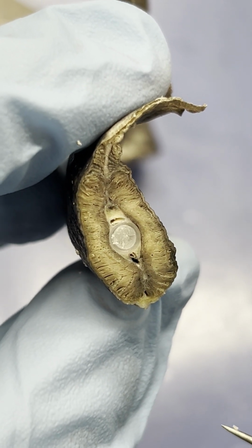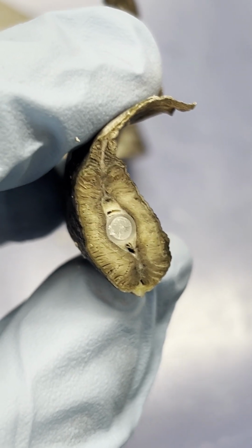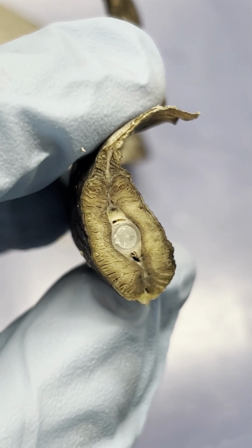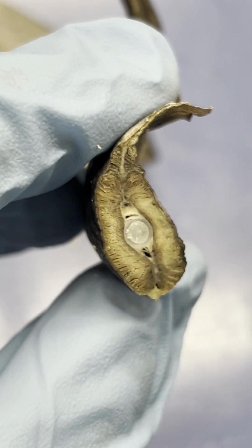Keep in mind that veins in general carry deoxygenated blood going back to the heart, and arteries generally carry oxygenated blood. We'll go over that more when we go over the circulatory system in depth. So again, this is the tail cross-section, 3.6D. Now let's go to the other cross-section.